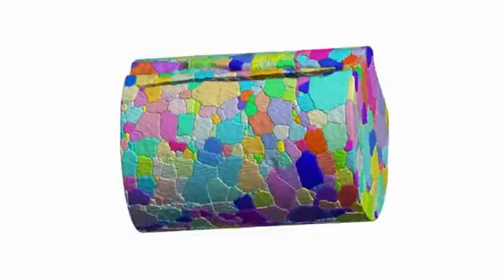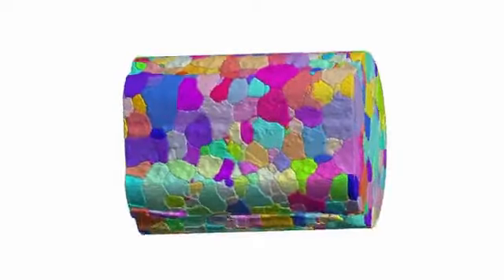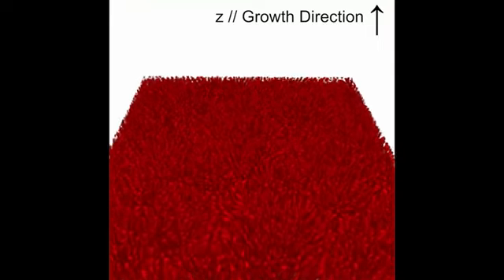The three-dimensional data that we obtain can be used to validate and refine theories that are actually in textbooks. And that's the power that we have as experimentalists. We can image pathways that are only talked about at a very theoretical level.